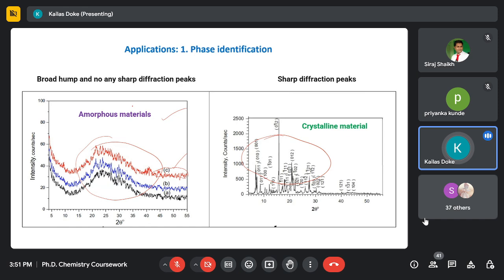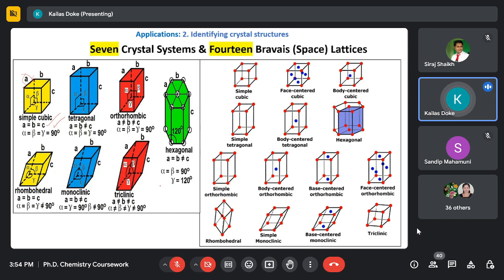These are the 7 possible crystal systems as per mathematics. As per mathematics, no 8th possibility or combination is available. Any science, physical science, physics, chemistry, depends upon mathematical concepts. So these are the 7 crystal systems, and if you see research papers, it has been found that there is only either a monoclinic crystal system or triclinic or tetragonal crystal system.